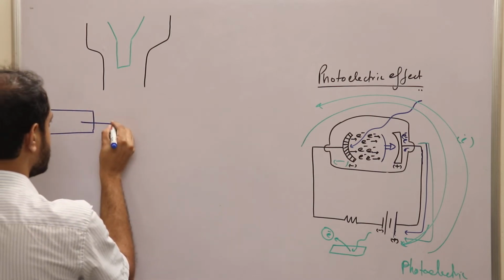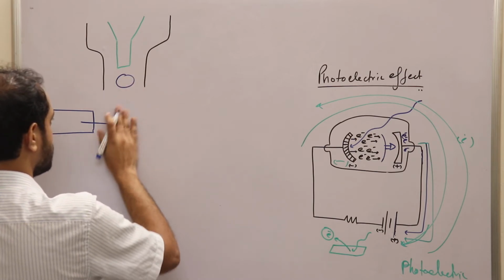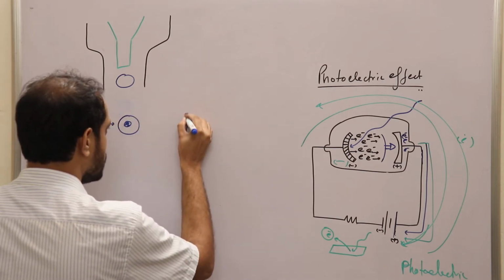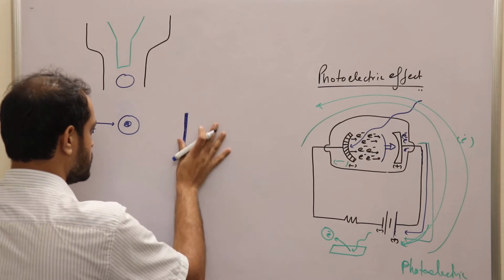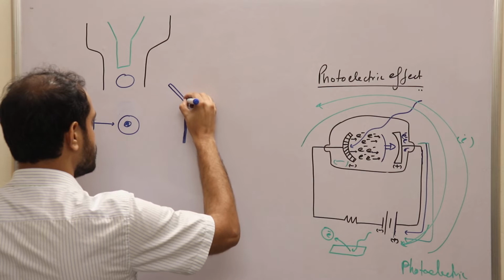It is emitting light. Cells are coming. And here we have the detection system. Is this the forward scatter or side scatter channel? It's obvious this is the forward scatter channel, right? And this is the side scatter channel.